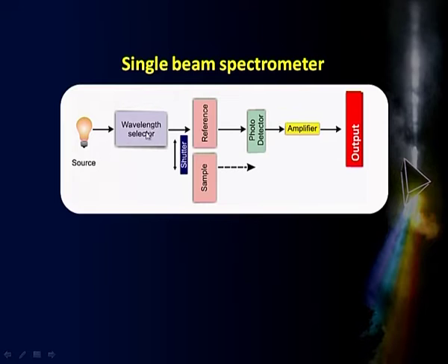Thereafter, with the help of some kind of shutter here, I remove the sample from my reference and bring the sample into the path, and thereafter I repeat the same exercise all over again. So, what happens now? I will be making the monochromator give out radiation starting from 200 nanometers to 350 nanometers and make it go through the sample and again generate the same amount of data.